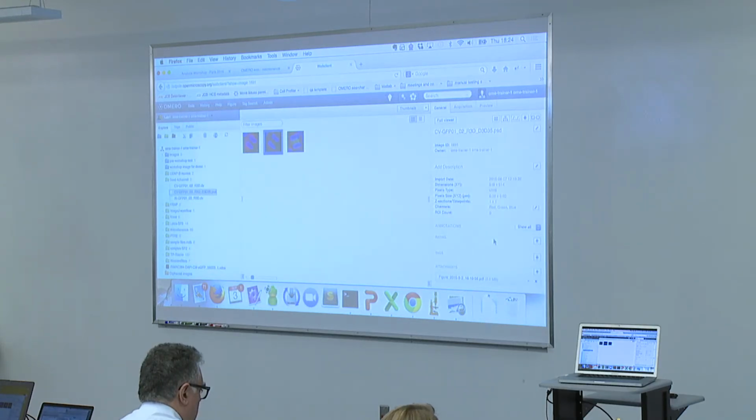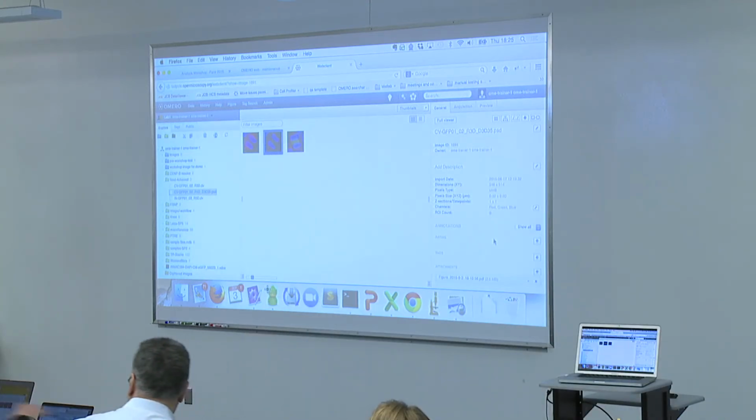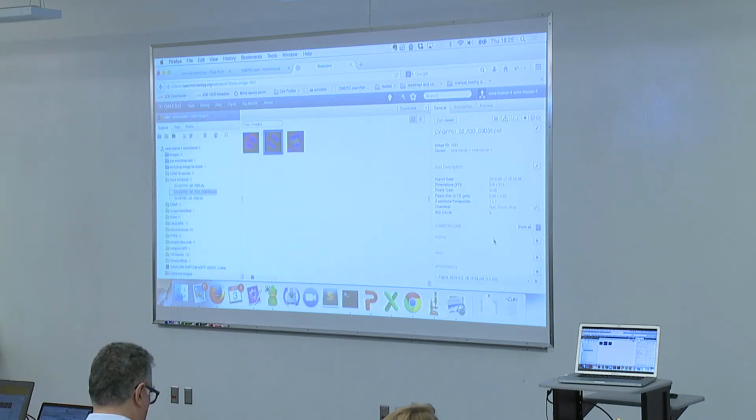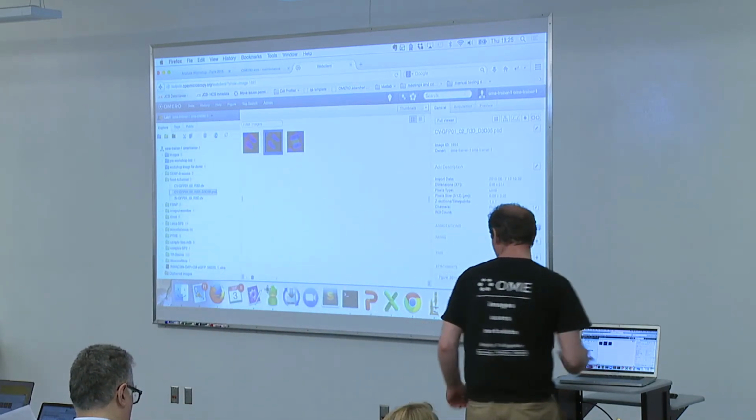Okay, so we have quite a bit of experience. We have our highlight point, the so-called big fish. This is a micrograph of, do you know how many thousands of pixels this has? Okay, so 120 gigapixels, did you say? Yeah. So this would be for one image. Right, there are two things to show.